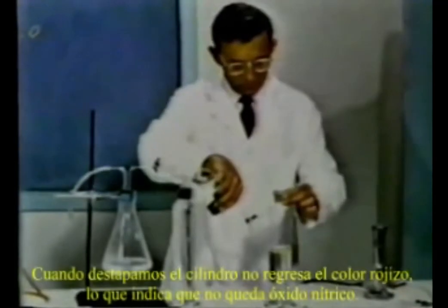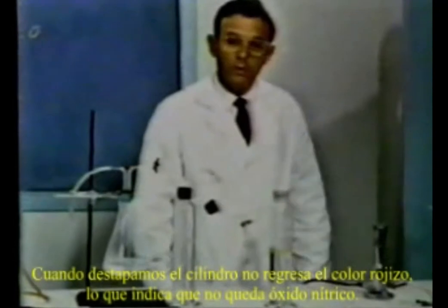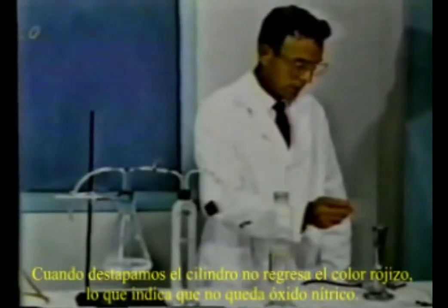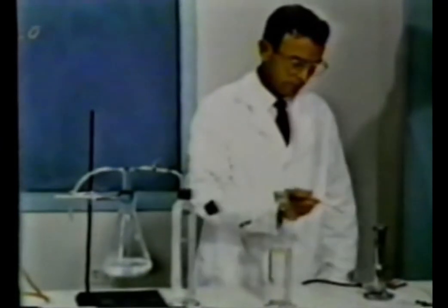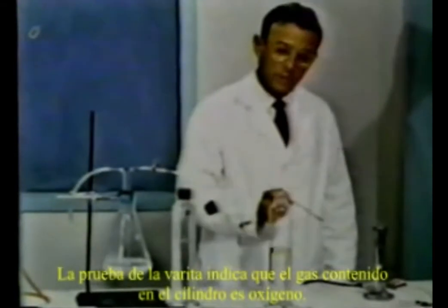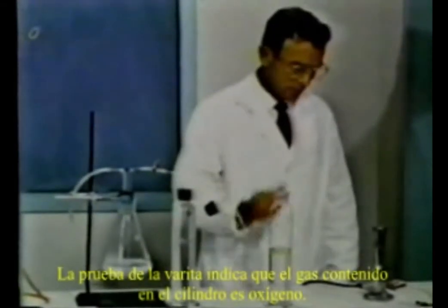When we open the cylinder to the atmosphere, no color forms. That indicates that no nitric oxide remains. The splint test shows that the residual gas behaves like oxygen.